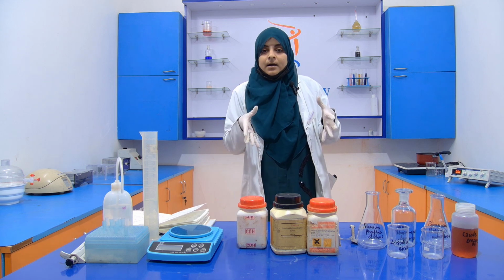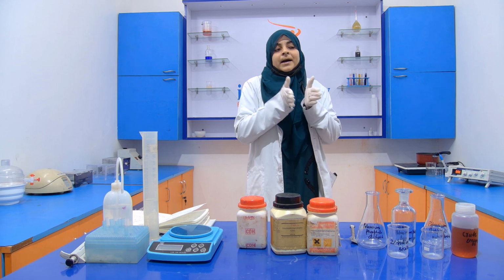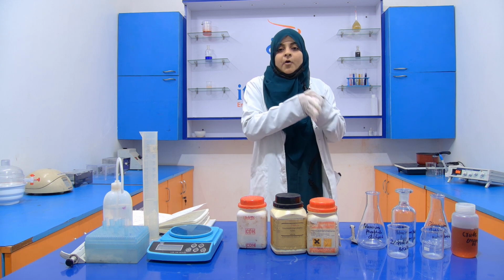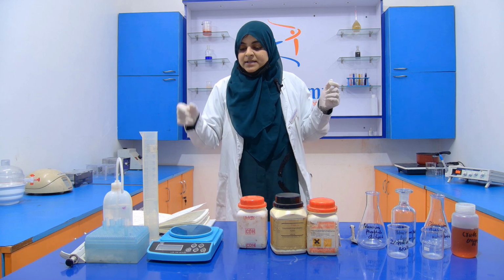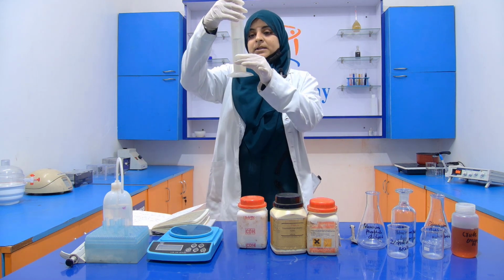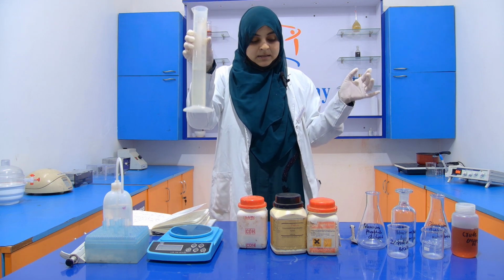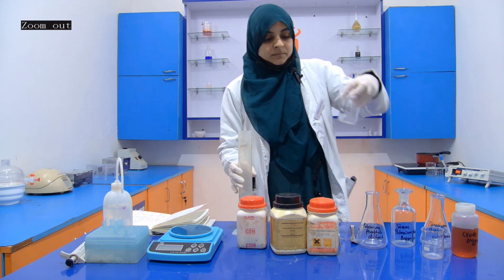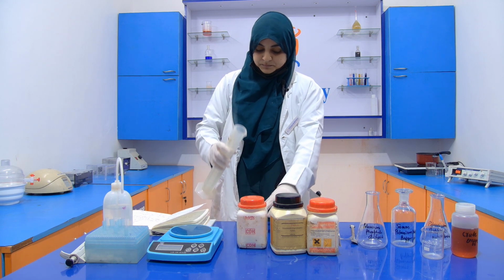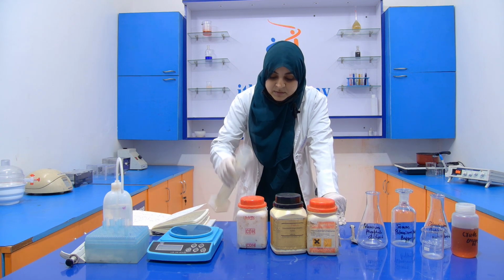200 ml. Okay, so for 200 ml, we require around 4 gram of sodium bicarbonate and 200 ml of distilled water. So this is our distilled water that we are going to prepare. So first of all, we take 100 ml of distilled water.